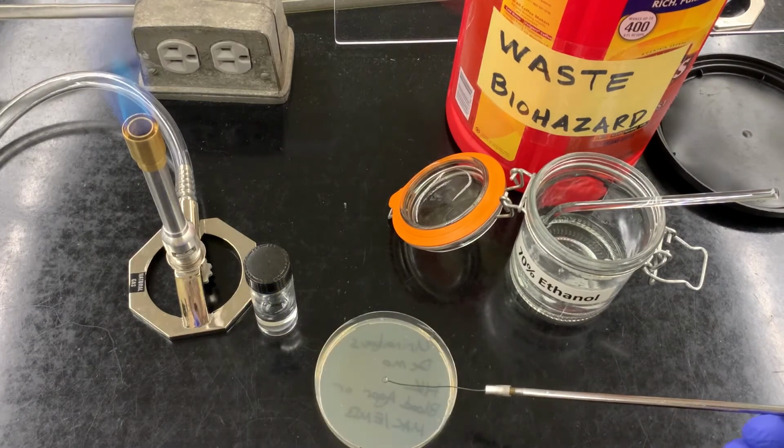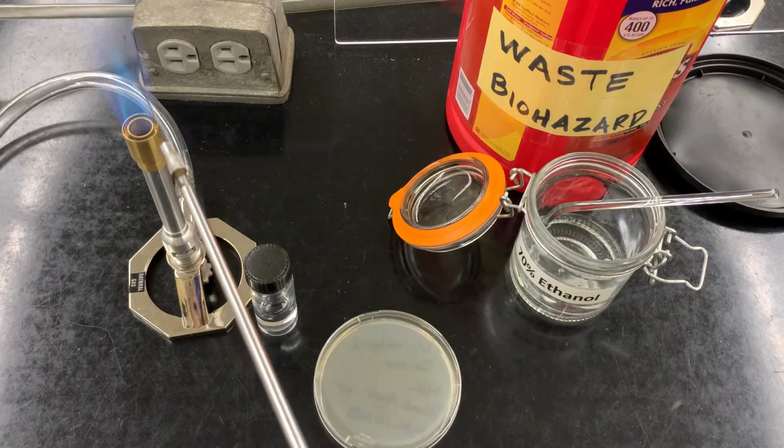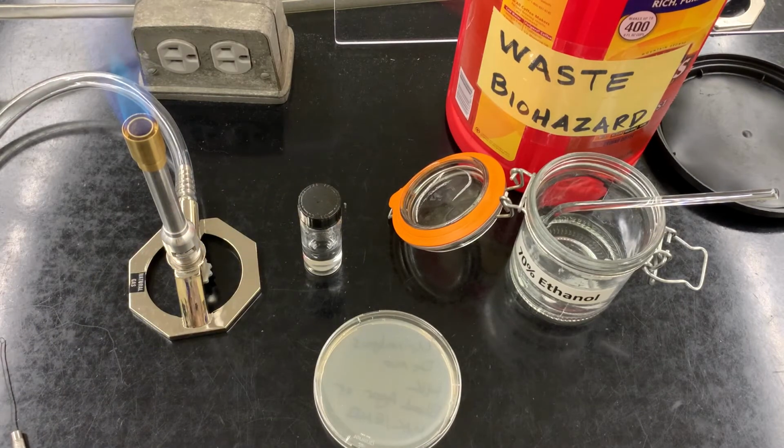Lift the lid, and then just place that drop right in that center. And our calibrated loop will deliver exactly 10 microliters, right? And it has to deliver a specific volume because we do want to quantify, right? And in order to be able to quantify, we need to know exactly how much is in there. Move this out of the way so it doesn't burn.